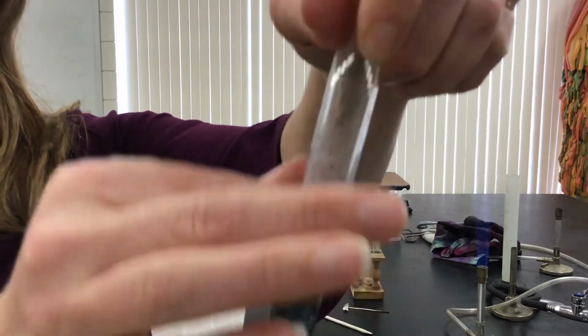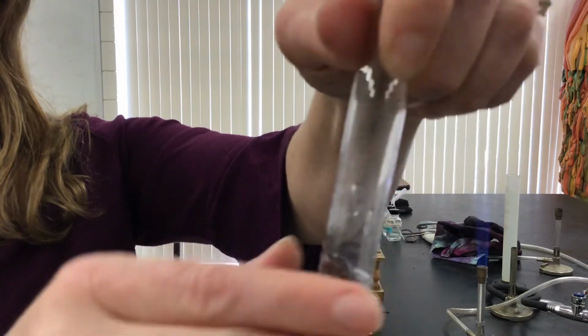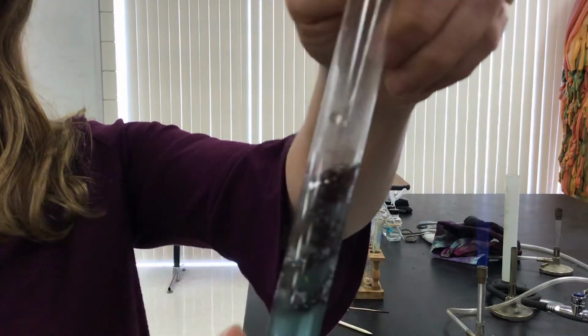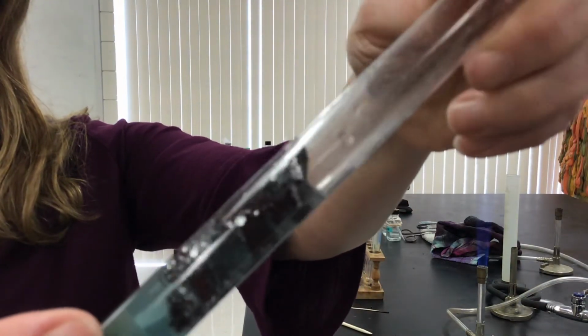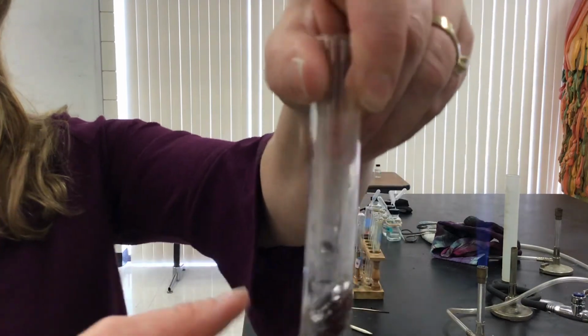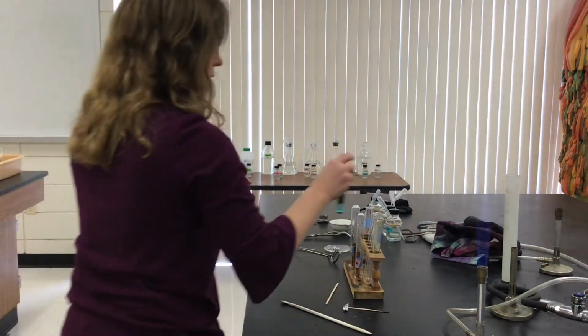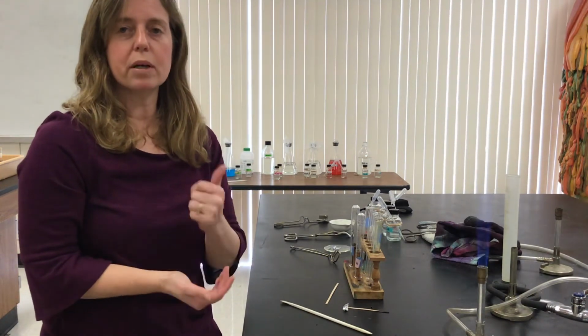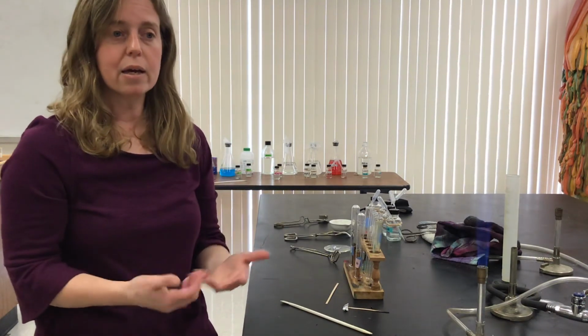Okay, so now you can see it bubbling, and actually it's warm to the touch. Even though I'm not heating it, because a chemical reaction is occurring, it's warm to the touch, and you can see this copper that's forming, okay, all around the test tube. And I would keep going, and as you can see, you can even look at the bottom and see pieces of copper there, okay? All right, so that's a single replacement reaction between aluminum and copper chloride, and we're making copper.